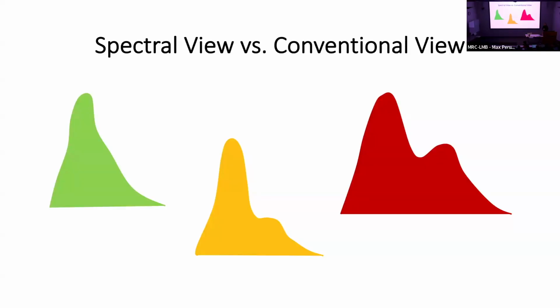A really nice aspect of spectral is that you can run your unstained cell type and look at its spectral signature, because every cell will have an inherent spectral signature, and then deconvolute that from the rest of your other cell types. This can be a really big advantage for people working with mixed cell populations, particularly from primary tissues, but I think it applies equally to any other cell types. So again, really great advantages to spectral cytometry.